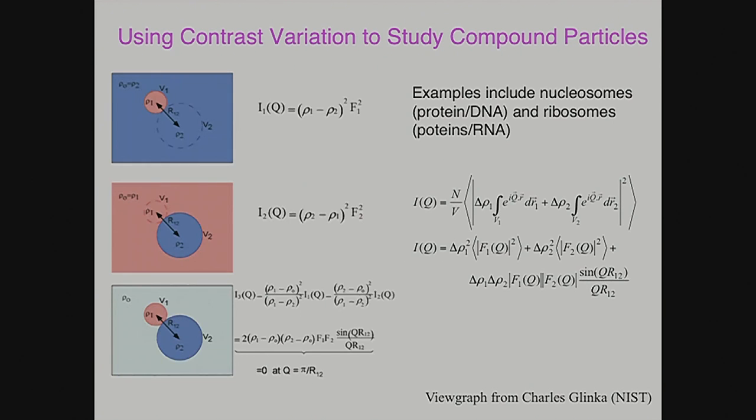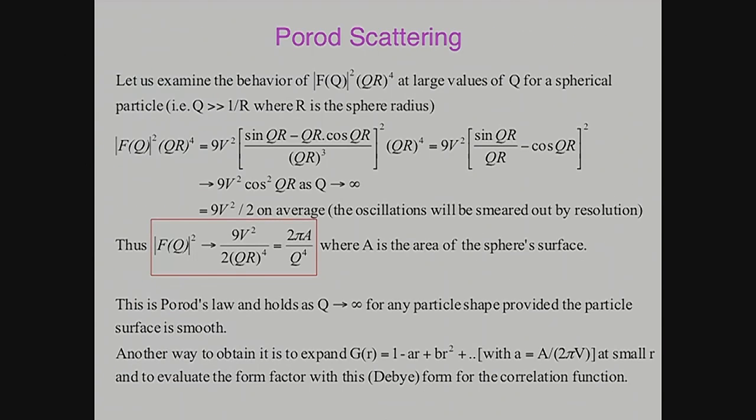Okay, so this is pretty obvious. If you have molecules with different parts to them and you want to measure what different parts of a molecule, you can match them out in different ways by using different carrier fluids with different concentrations so that you see different scattering, and from those different scatterings you can deduce the structures of the individual parts of a molecule.